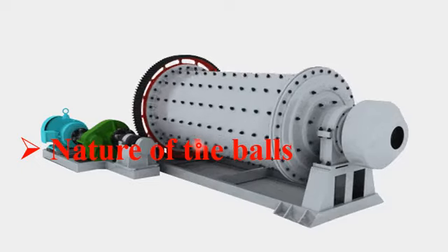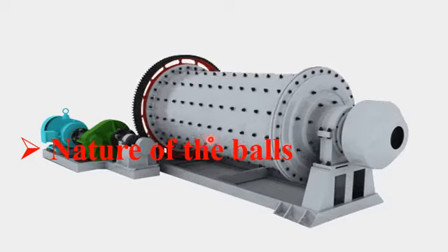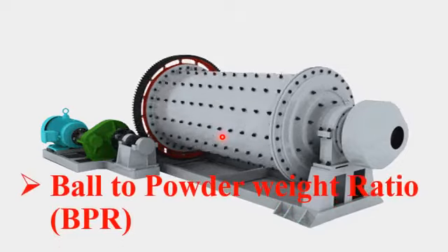And in case you want to mill soft materials like polymers, there are also rubber balls used in ball milling apparatus to crush them and convert them into nanoparticles. Okay, another key parameter considered in a ball milling apparatus is the ball to powder ratio.